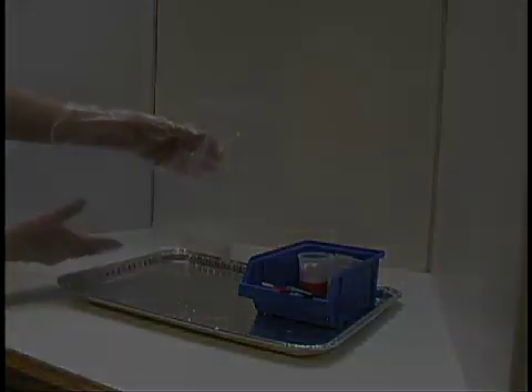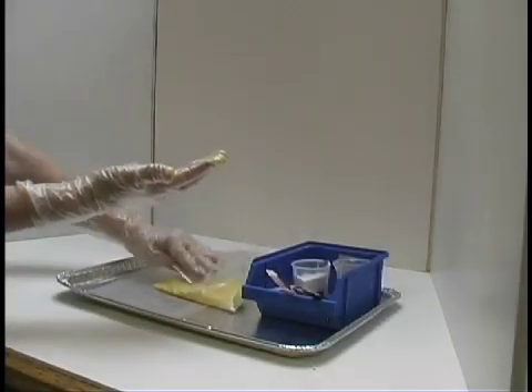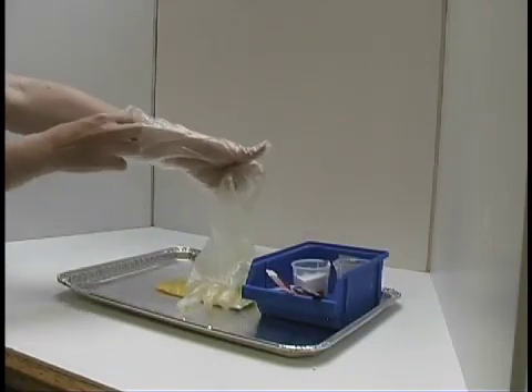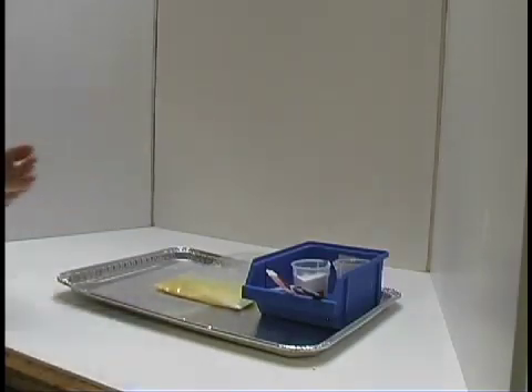When you are done with the reactions, take your tray with all your bags over to the sink. Remove all the tubes and wash them out, then throw the bags away. Take off your gloves by turning them inside out, then throw them away, and put your goggles back where you found them. Make sure you wash your hands before leaving the classroom.